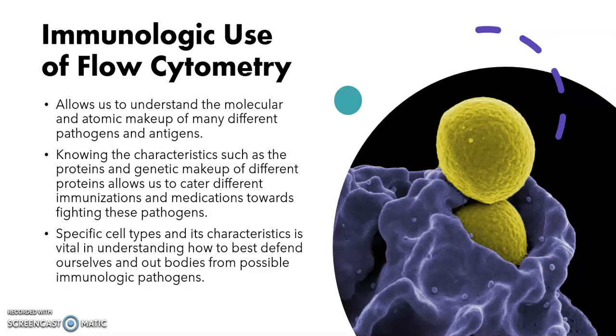Like I said, it's like making a map, and you could follow that, and you could also break down exactly what is attacking us, and we could find weaknesses in it, or in many pathogens through this.